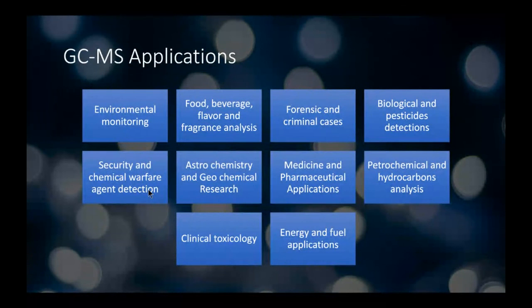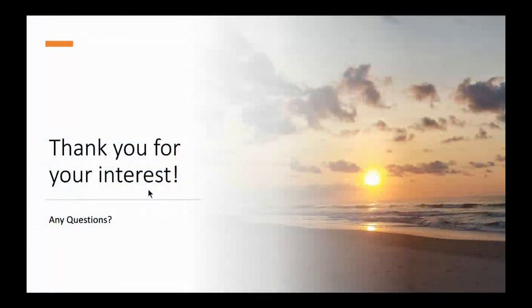These are other applications up here that are just from literature, and hopefully you'll see one up there for you. Let me encourage everybody, if you want to use the GC mass spec for any of your laboratory work, please let me know. There's probably a technique out there that we can use, even if it's plants. I know I've worked with Mr. Horn in the past on trying to do things for tomatoes. We've also had a number of other things, like the aspirin lab. If you want to do kinetics, we can do things like that. So with that, I think that concludes everything for us.